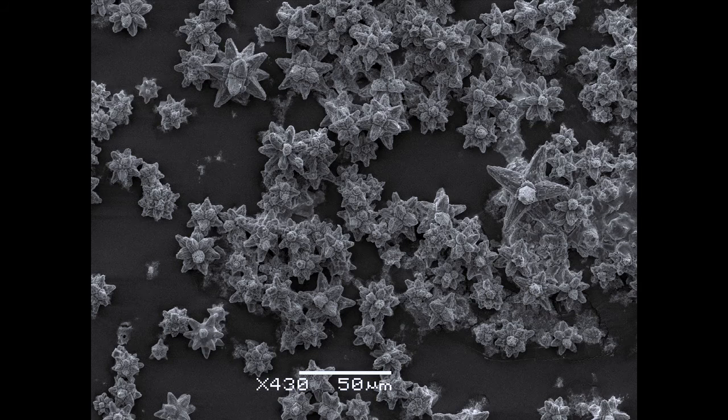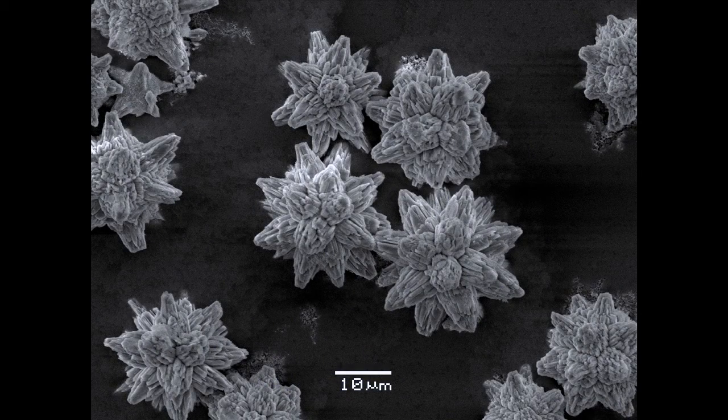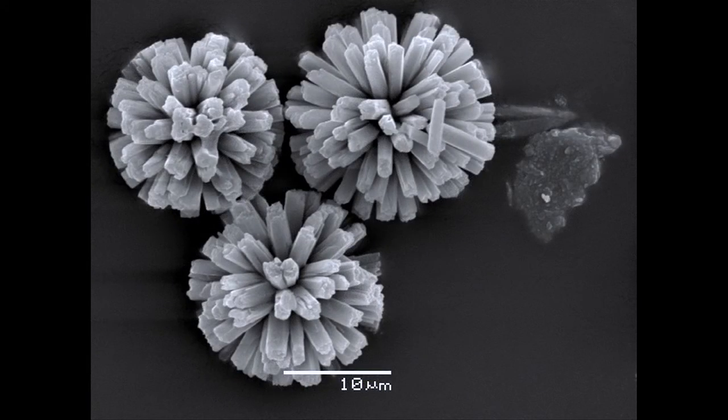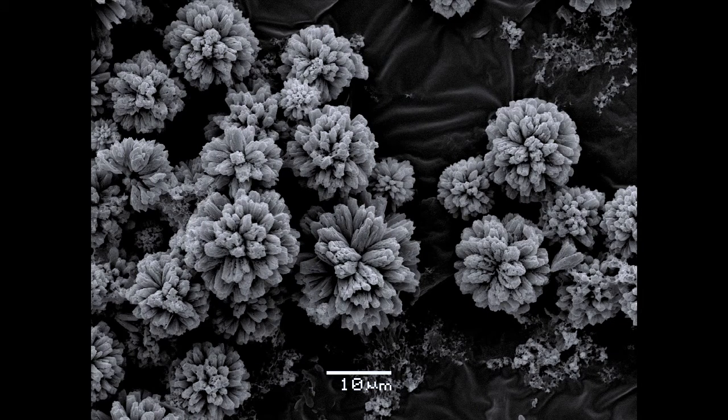This is how the dominant spicules look like under the scanning electronic microscope. They are usually stellate, but the number of rays may change. You would like to count the number of rays in an equatorial plane. Take notes of the shape of the rays — they could be more conical like these ones or more cylindrical. They could be short or longer, and they could have blunt tips or acute tips.